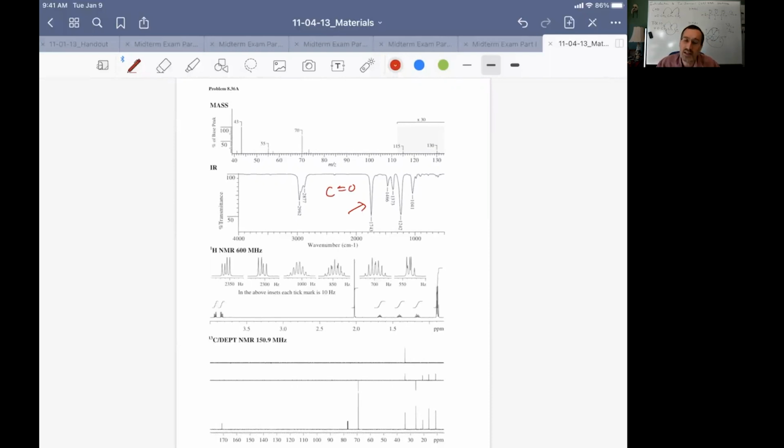And one of the things on part 1, problem 1, I really wanted people to be able to do was read their spectra, whether they were digitally marked or just in analog, and be able to look and say, okay, that's a carbonyl, and it's high for a ketone, and it doesn't look like an aldehyde. It's probably an ester. And sometimes, but not always, we can see the C-O single bond stretch depending on how crowded the fingerprint region is.